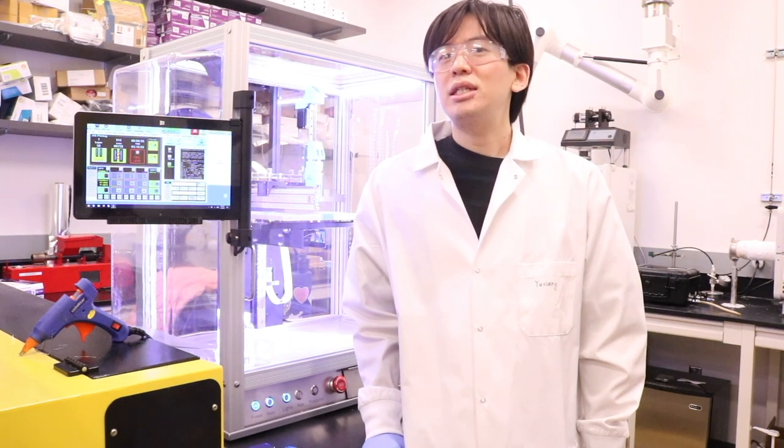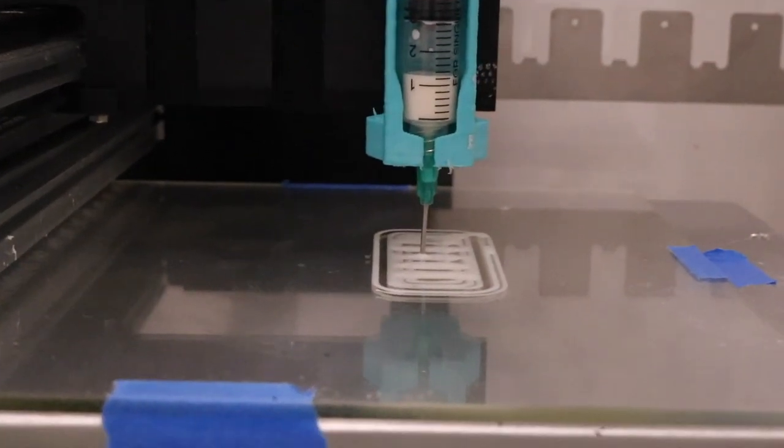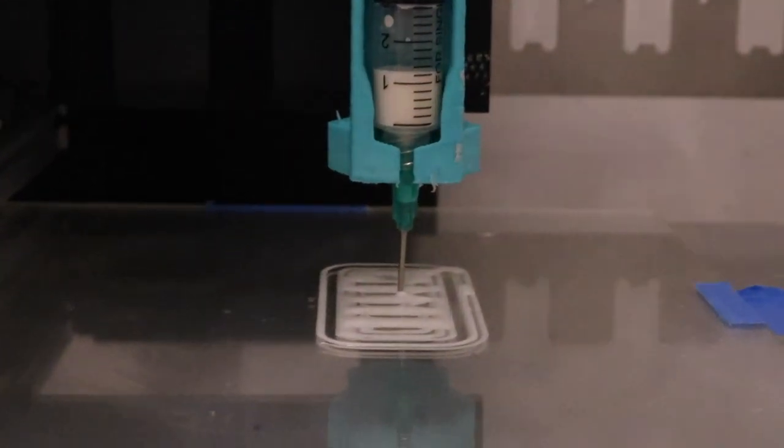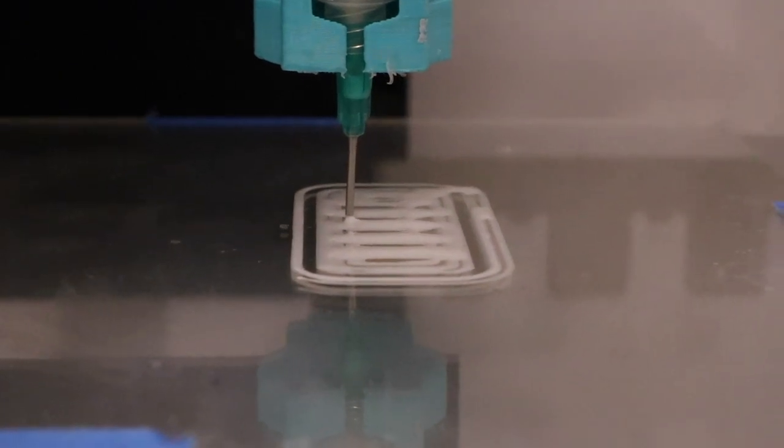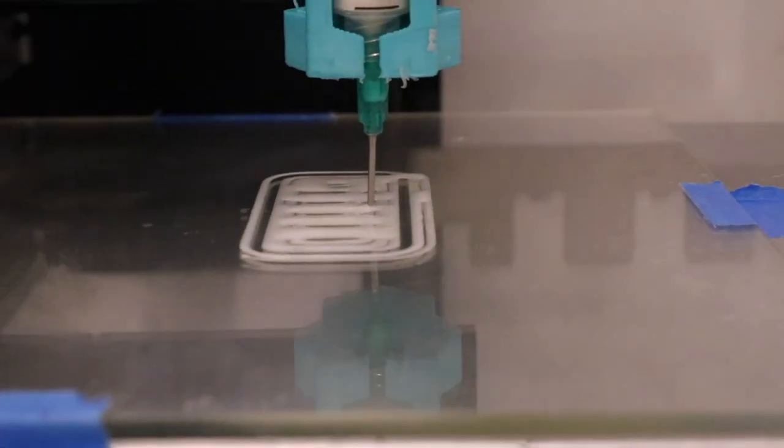3D printing or additive manufacturing is the construction of a three-dimensional object from a digital 3D model. It was invented in the 1970s. The printing efficiency and resolution are still developing. In 3D printing, the nozzle and the printing bed are controlled by a computer with materials being added layer by layer. This printer can do extrusion-based printing, meaning it can print polymer melts from a heated nozzle or polymer solution from a syringe. We first edit a digital model with the computer, then import the file into the device, telling it what to do.